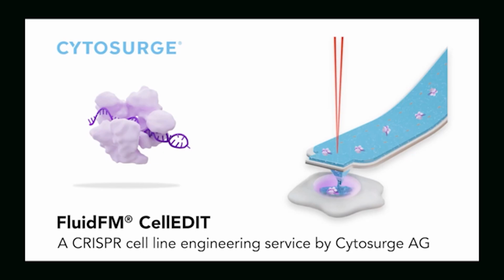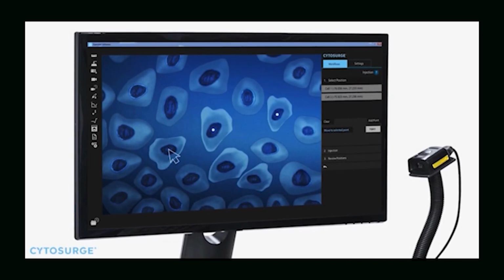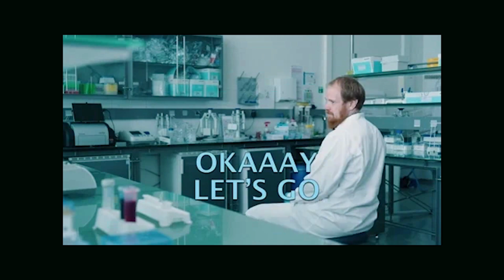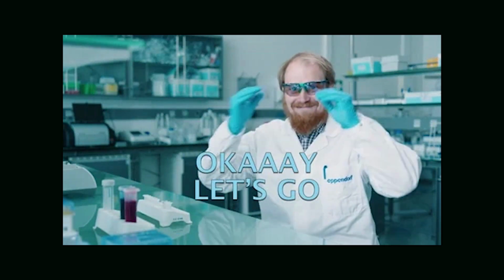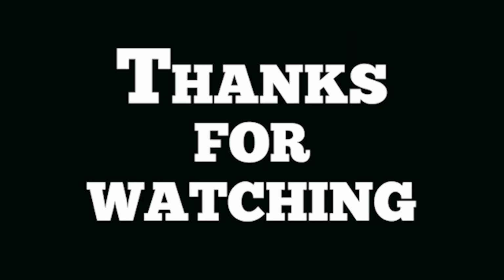Live-seq uses fluidic force microscopy to take cytoplasmic samples from living cells prior to sequencing. This method doesn't actually kill the cells like the others do. Transcriptomic profiling is one of the tools scientists use to understand our biology, and RNA-Seq enables this. This was RNA-Seq in 100 seconds.